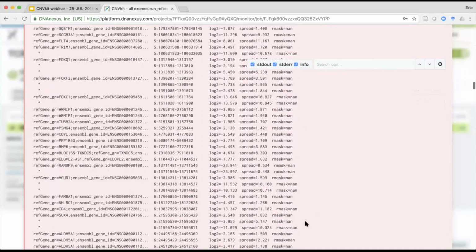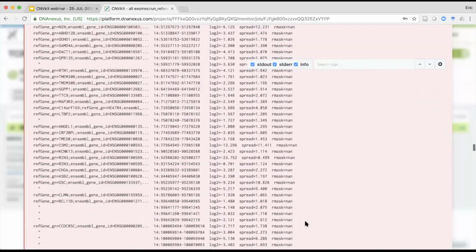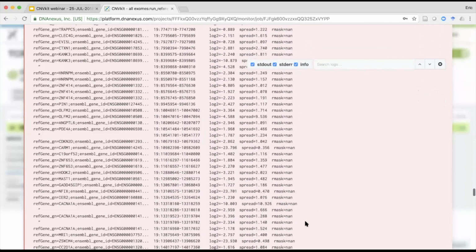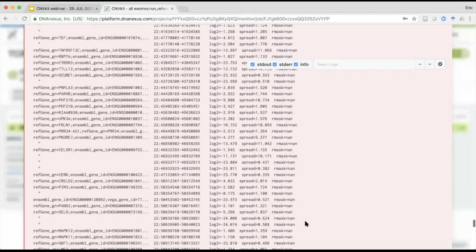Exome capture is basically unbiased, so you're attempting to capture genes that are maybe a single exon in weird genomic locations. We expect some noise to come out of exome sequencing versus a curated target panel where you already expect the genes to be well behaved.